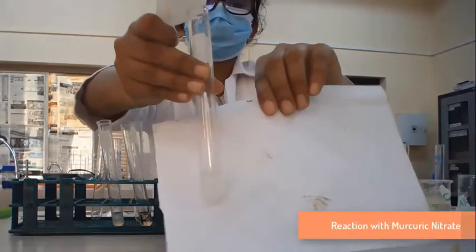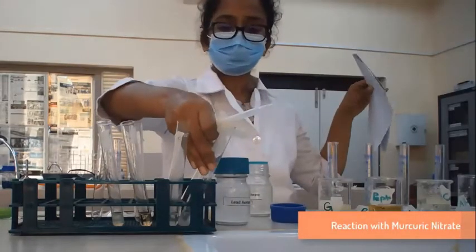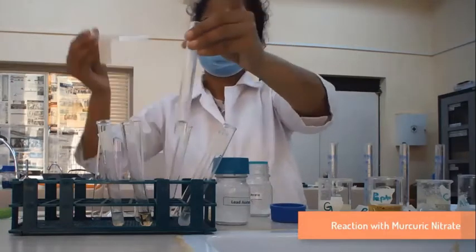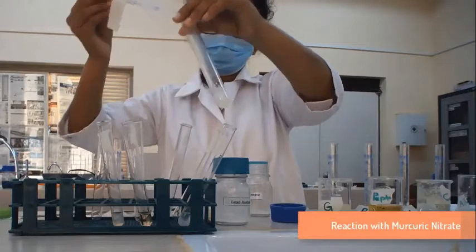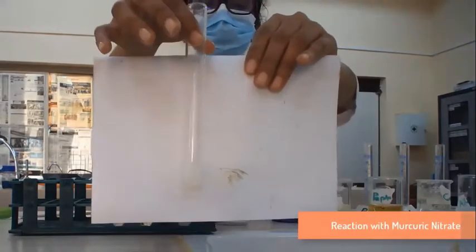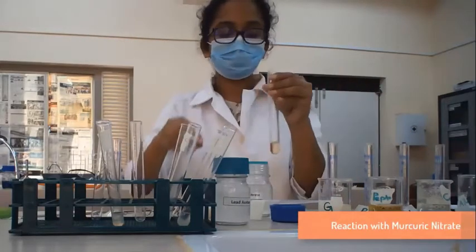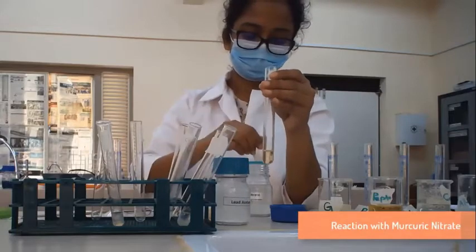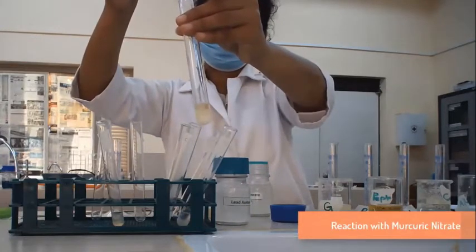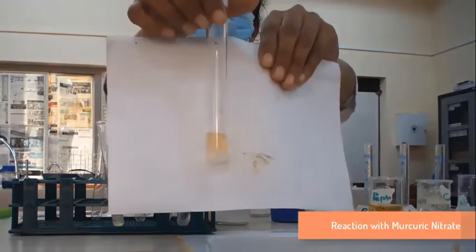Precipitation occurs in the egg albumin with the mercuric nitrate. Then I'm going to test it with casein. In casein also, it forms a precipitation with the mercuric nitrate. Then I move on to the peptone. Peptone also gives a precipitation with the mercuric nitrate.